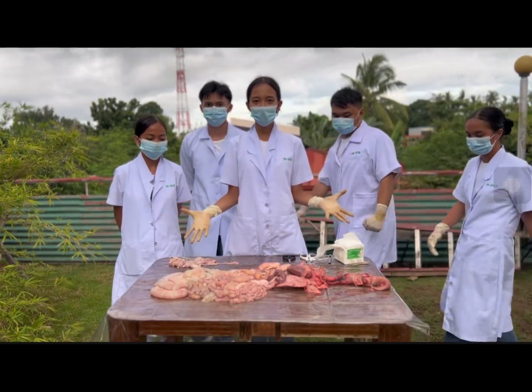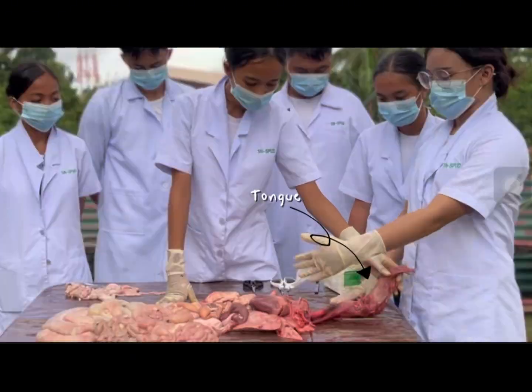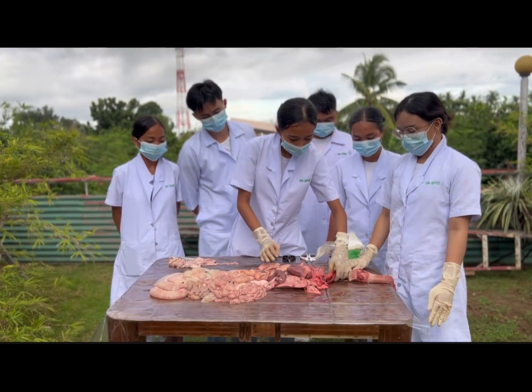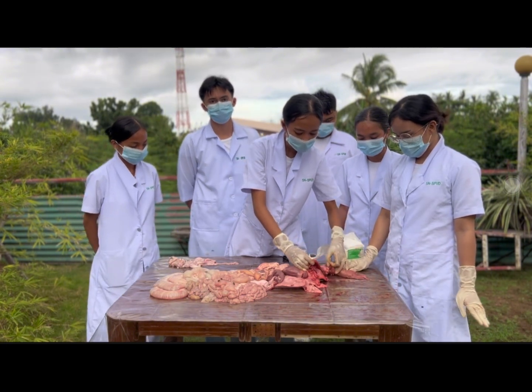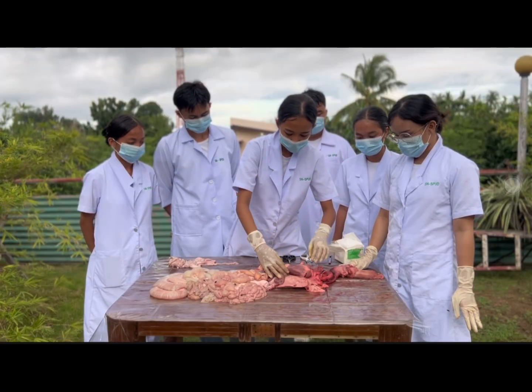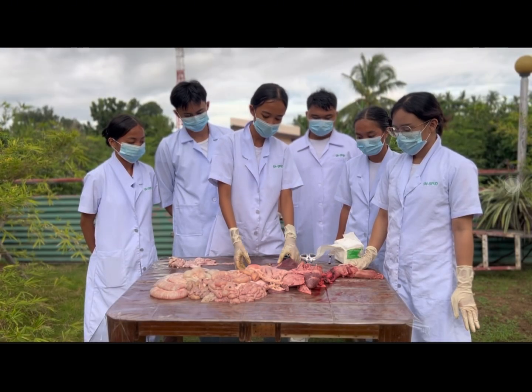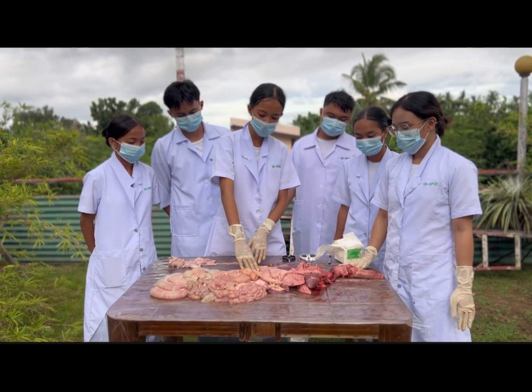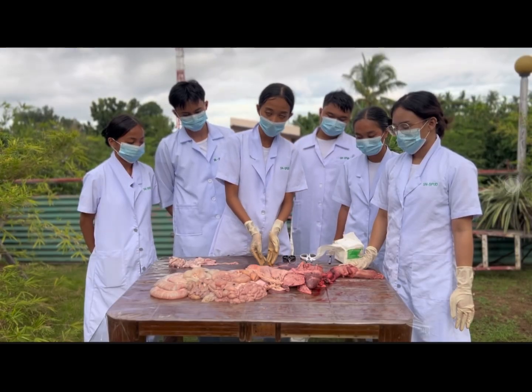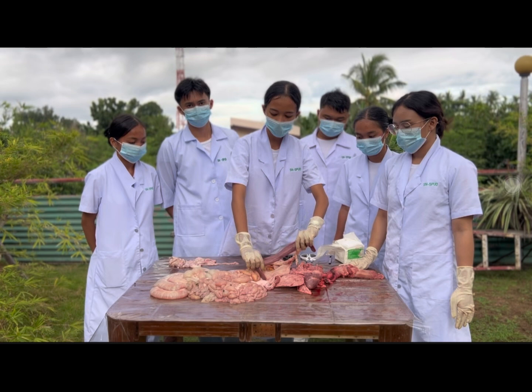Now this is the whole gastrointestinal system of the pig. You can see here the tongue, then down, inferior to the tongue, is the esophagus. Then we can see here the stomach. Now on the right side of the stomach, we can see the liver together with the gallbladder. Now attached to the left side of the stomach is the spleen.